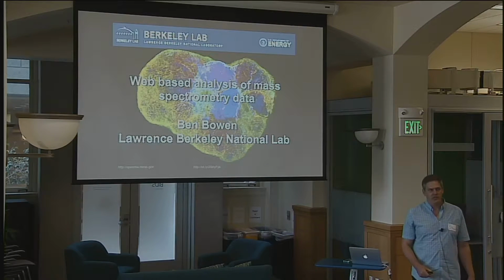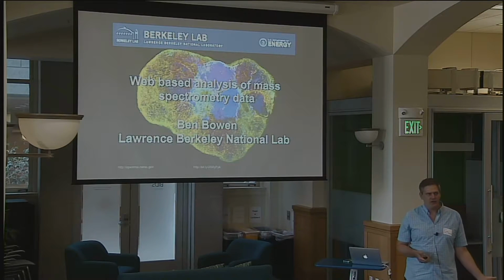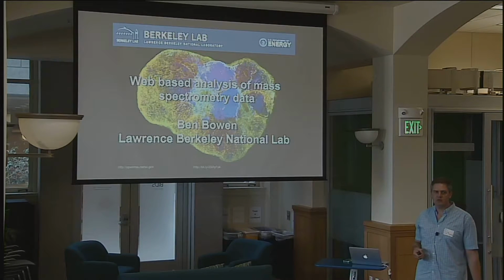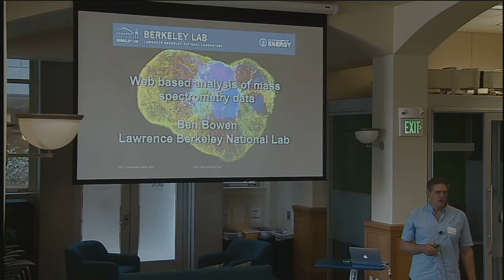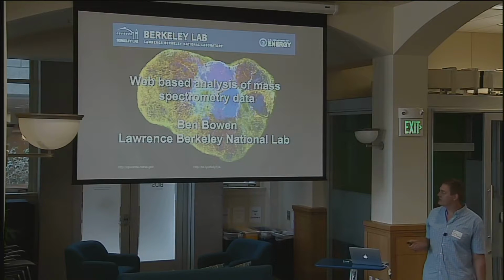The red, green, and blue colors from this image, or a traditional histopathology image, could tell you something about the morphology of cells, which would tell you something about the way to treat those cells. And a great deal of effort goes into analyzing tumors based on morphology and red, green, and blue images.